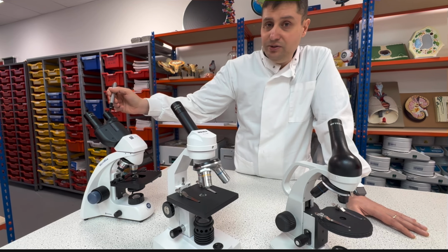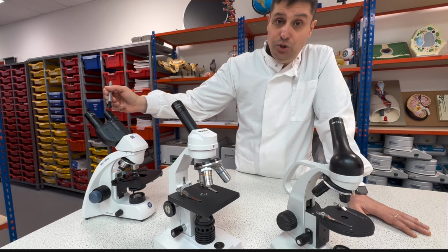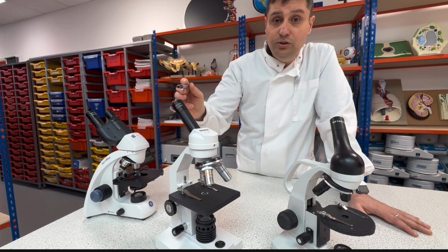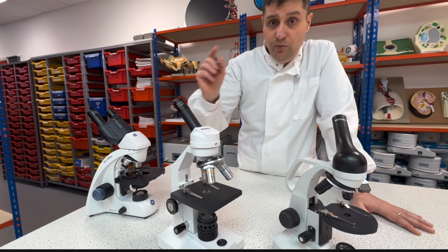For the A-level microscopes, for example, this is called a binocular microscope. Bi stands for two, ocular for eyes. This one is called a monocular microscope because it has just one. Mono stands for one.